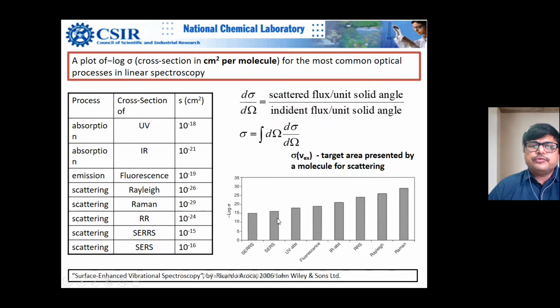And also we looked at four different strains of dengue virus, and we looked at the antigen, actually non-structural proteins of dengue virus also, and we got very good signal here. Normally proteins don't give you good Raman signal because of the low electron density. Electron density is not very good in low Z elements.